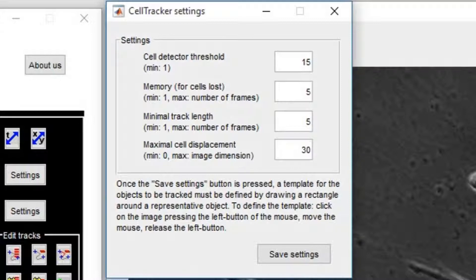Set a small value as a first attempt. Memory for cells lost represents the maximum number of frames kept in the software memory when a tracked cell becomes temporarily undetected.